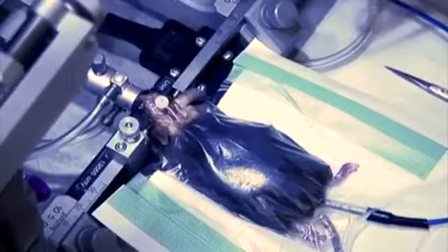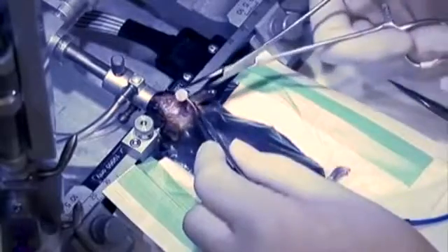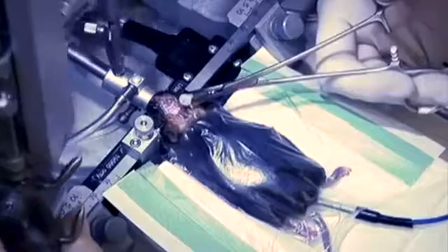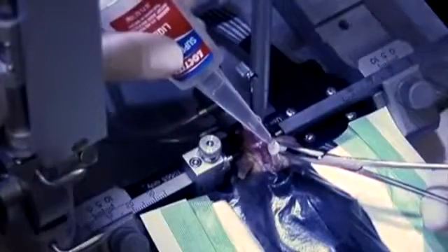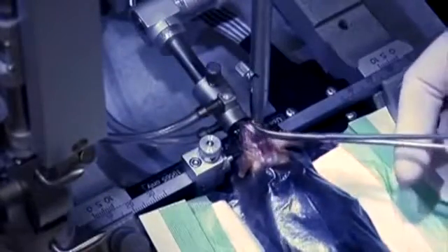Be careful to not let the catheter touch anything. With the curved hemostat, grab the cannula at the groove where the top meets the pedestal. Move the cannula driver into position and secure into place. Then, place a single drop of superglue on the base of the cannula and push the top of the cannula into the driver and position it so that the tubing is pointed straight back.